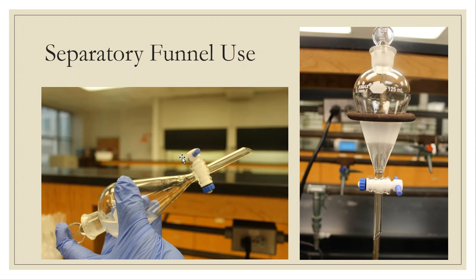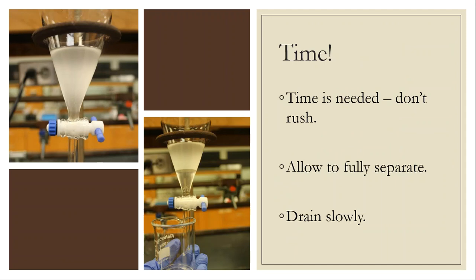So that way, if there's pressure that gets built up, that pressure can escape out of the funnel, and then I'll just close the stopcock back and turn it back upright, and then allow these 2 layers to separate on me. So that's what I'm doing in these pictures. I'm rocking the separatory funnel, and that's what we call that.